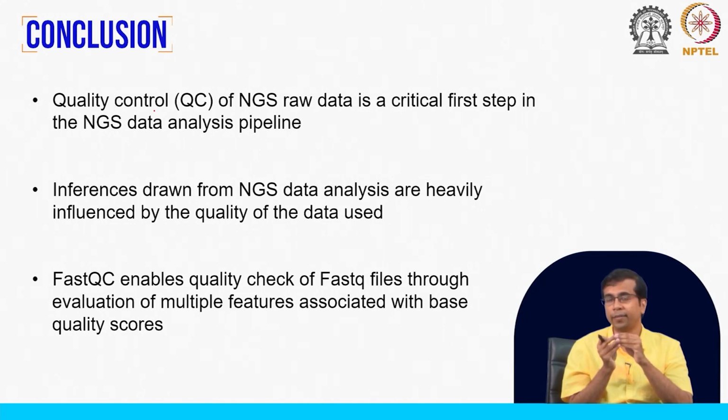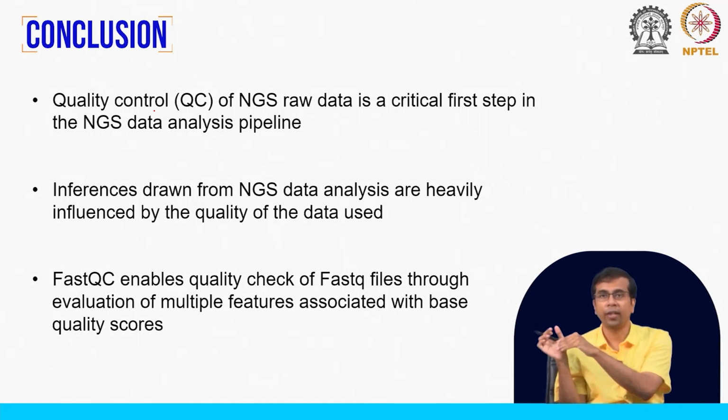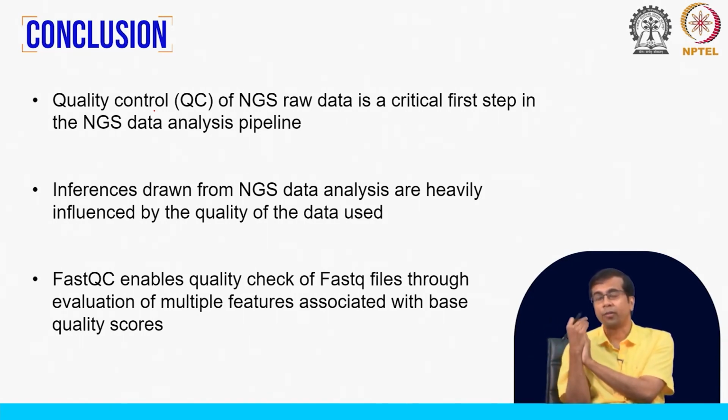For per sequence quality, we can leave out those reads, but what about the reads where the initial part is of good quality, but the rest of it is not? The quality drops as you go along, and maybe it drops so much that it goes into the red zone, and we probably do not want to use that region. This region may contain certain mutations which will give us wrong results, so we want to discard those regions.